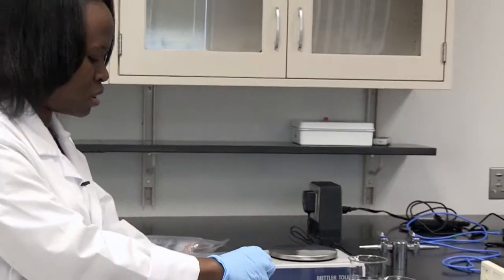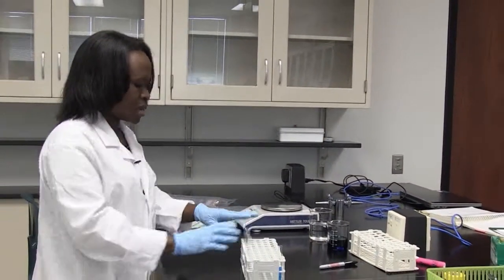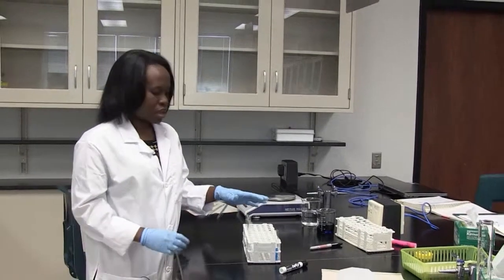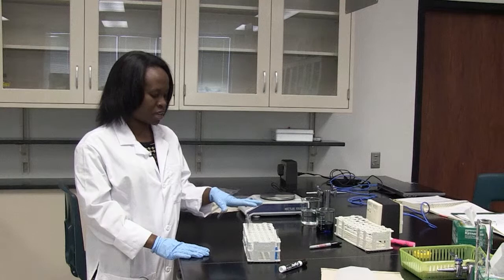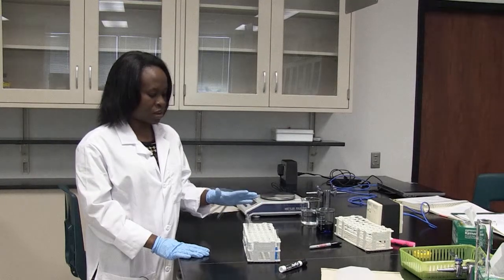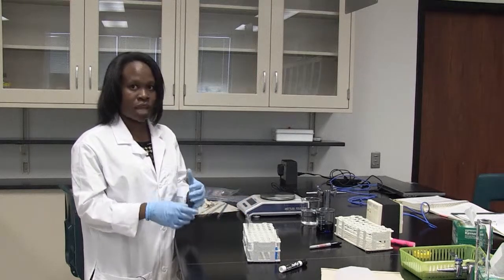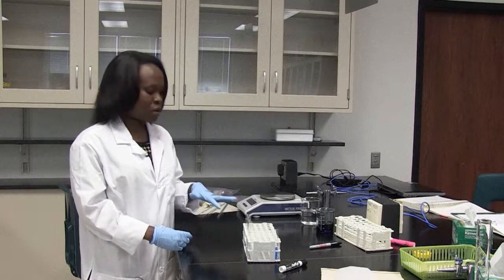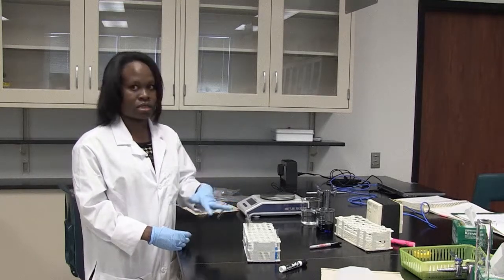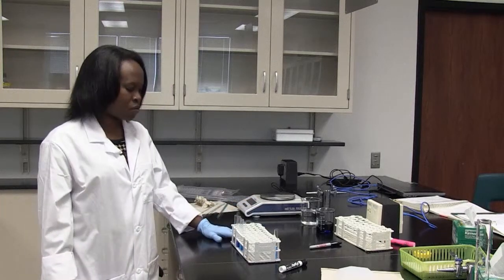Making serial dilutions is important. For example, in medicine, when they want to determine a correct dose of a medication to give to a patient, if you're not sure exactly of the dose that will work, you can do a series of dilutions to determine what dose is best suited to manage the patient's complaints or illness. So that is basically how you do dilutions in the lab.